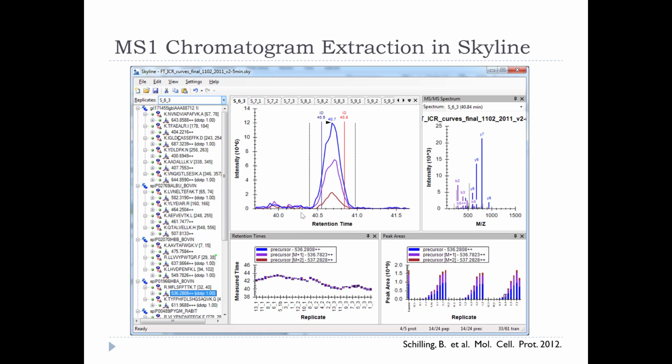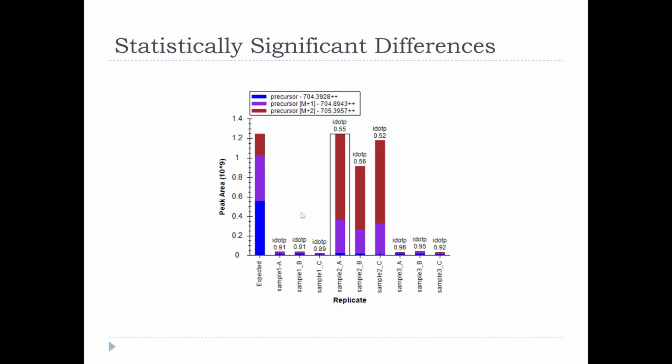Okay, so what over here? What kind of experiment was it? Yeah, it's a dilution series, and this is the acquired order. We know that because when it's not the acquired order, we have a whole lot of jumping around in the retention time, and so we acquired them in 3 cycles rather than 1, 2, 3, 1, 2, 3. So you can learn a lot just by looking at these plots, right? A screen full of Skyline information can show you quite a lot about your experiments.